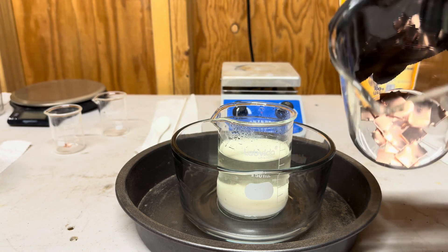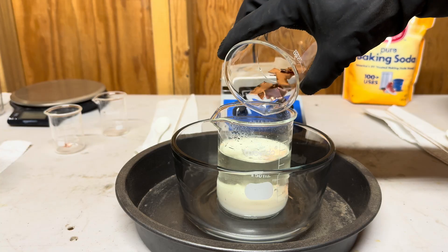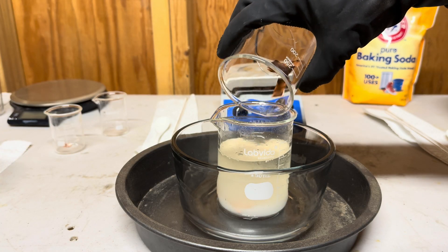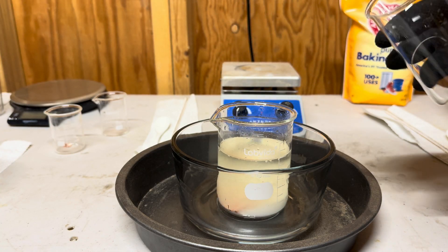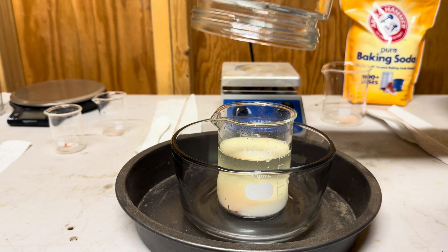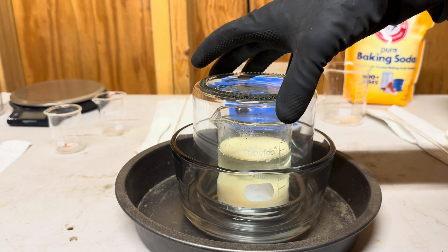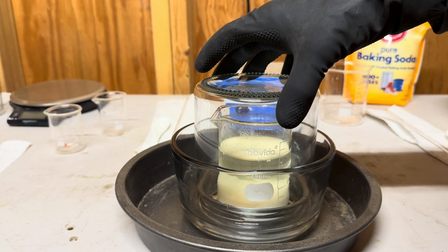Now add at least 32 grams of copper and pour it into the acid mixture container. Then place a container large enough to fit over the inner container but small enough to fit inside the outer container into the apparatus.